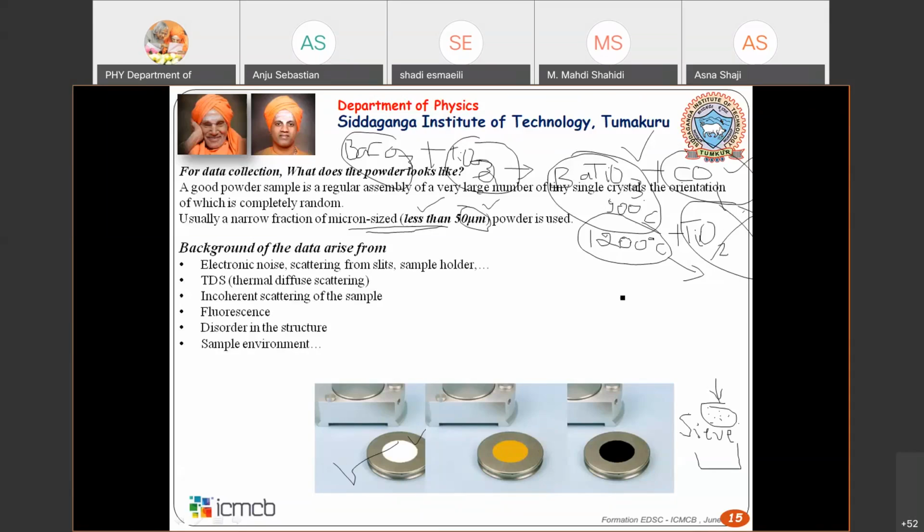Okay, so you have your sample. Normally most people put the mask before the sample. So you can ask your X-ray person or your X-ray in charge to put the mask after your sample. So in that case, you can reduce this kind of fluorescence.